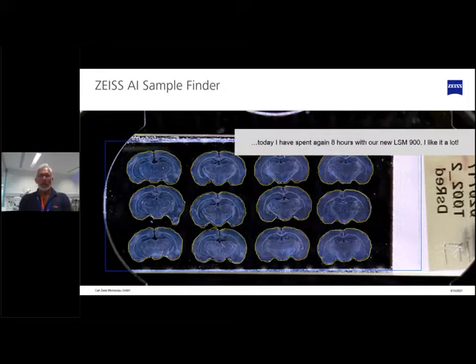Being with Zeiss as a salesperson and application specialist for quite a long time, I like such a warm welcome. Somebody being happy with the latest Zeiss microscope. 8 hours sounds like a long day, but I'm quite sure at least 1 hour has been spent on picking the next position, picking the next sample, traveling back and forth all the time.